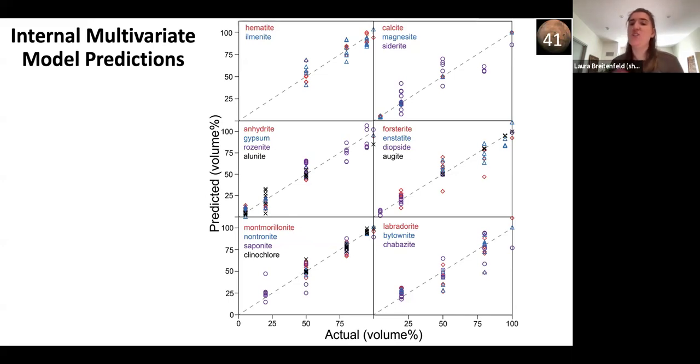Again, here I did do a more robust study into the error of this model, and the reason for this is it's really important to make sure we're not just evaluating the error of data within the model. So we did cross-validated root mean square error values as well.